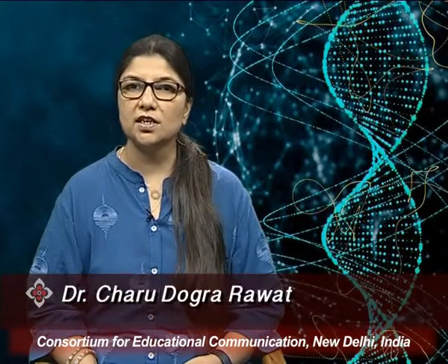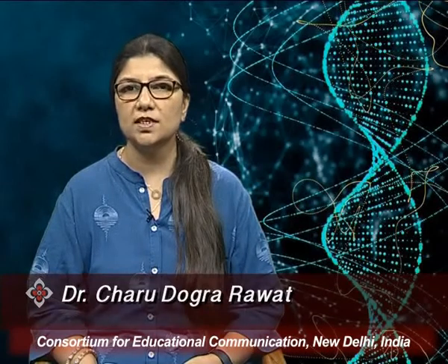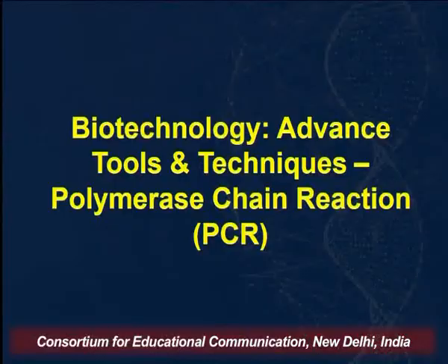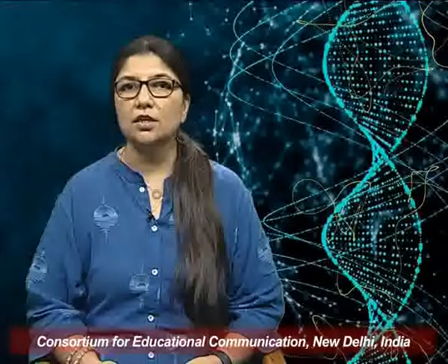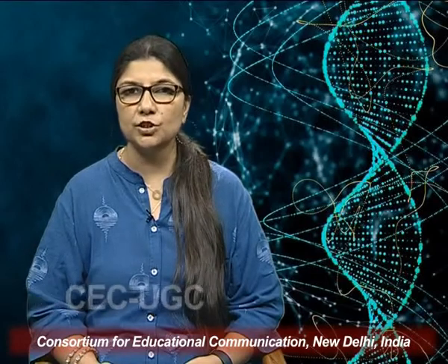Today I, Dr. Charu Dogra Rawat, Associate Professor at Ramjas College, University of Delhi, would be discussing advanced tools and techniques, in which I particularly talk about the polymerase chain reaction. The learning objectives for today's session would be to understand the principle and procedure of a simple polymerase chain reaction and to understand the principle and procedure of various types of PCR methods used in biotechnology.